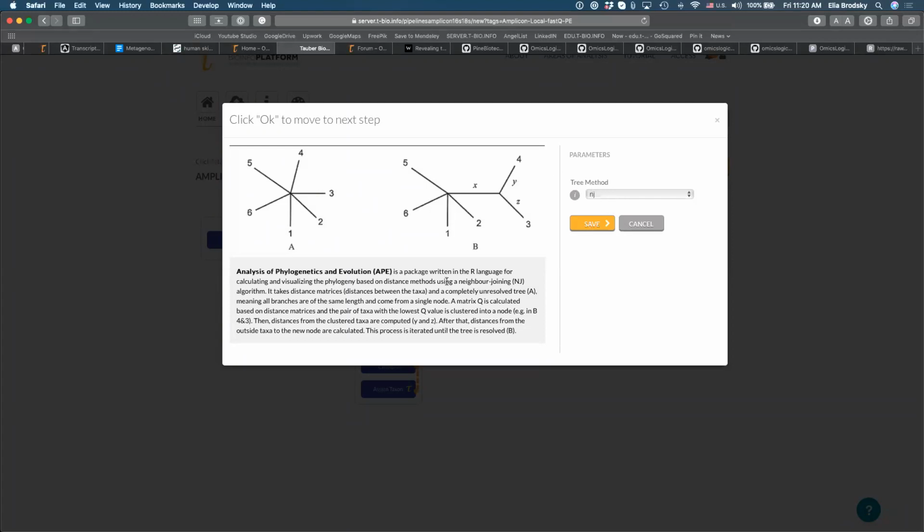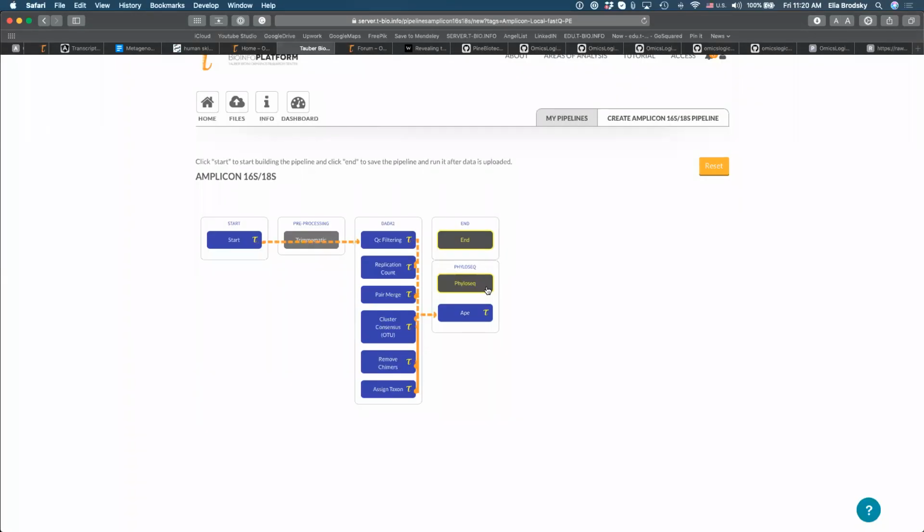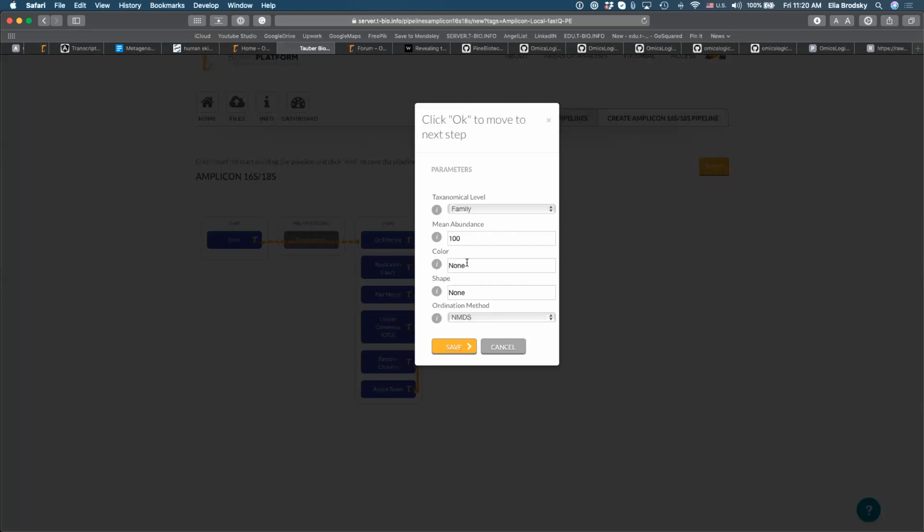There's a couple of different methods for building that phylogenetic tree, and neighbor joining, NJ, or BioNJ, is just a different method of doing this. And then this is what we can also use to visualize all of these different types of relationships. Here, again, remember that typically we're going to use phylum, which is not a very detailed view. Obviously you can try other ones and you'll run into some NAs, but phylum still provides a good overview. The mean abundance, we can leave that for now.